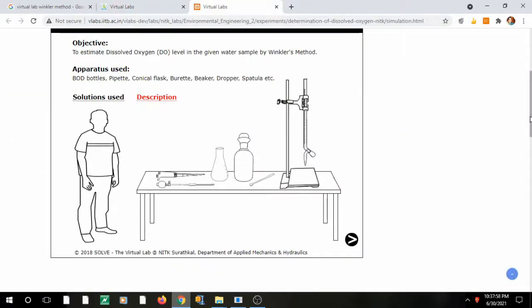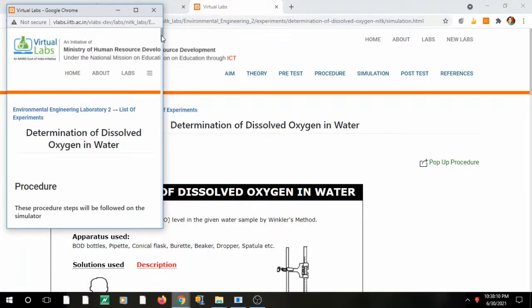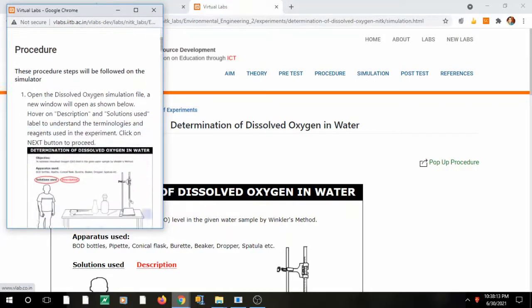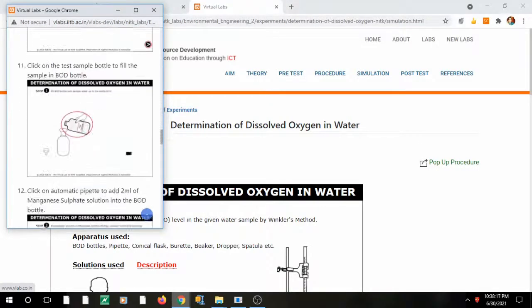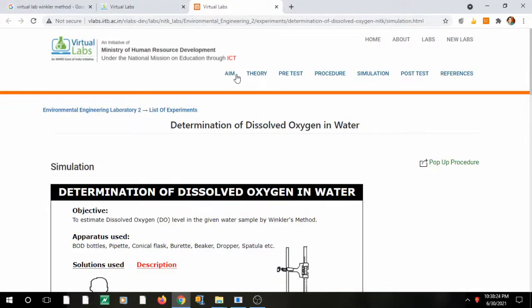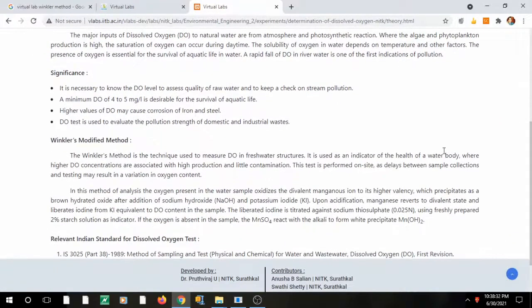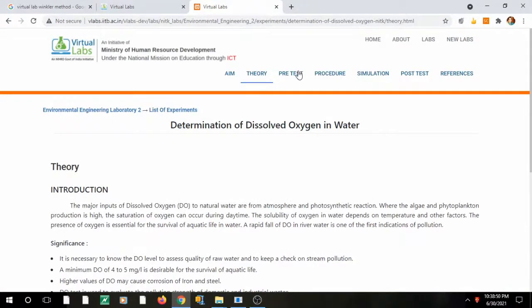When you click on the items one by one they will open. Click on the procedure and it shows each step — first, second, third, fourth. You can also click on theory, which gives the significance of DO: a minimum of 4–5 mg/L is desirable, a higher value causes corrosion, and explains the Winkler modified method. The azide-iodide is a modified method; earlier, azide was not used.